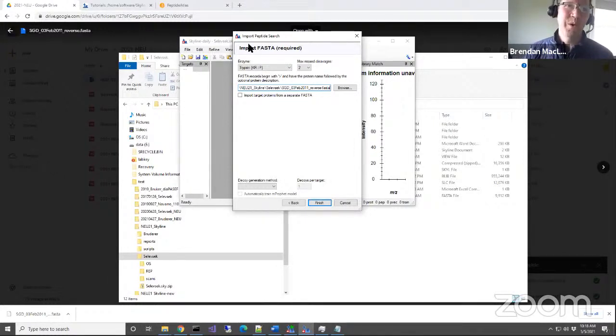Okay, so now I'm going to use my poll. I'm going to launch the poll and say, are you ready to continue? Maybe people can just start answering yes. Okay, well, there we go. Some people are just answering no. Let's see how many people are actually doing this, and how many want some extra help to actually get this. It would be great if we could have even more people succeed at creating the template.